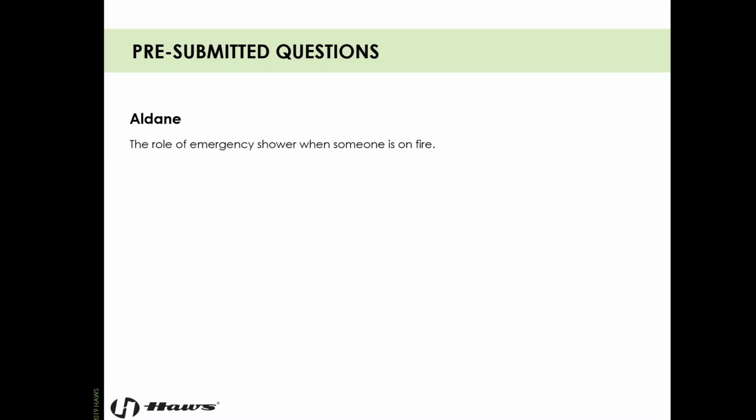Aldane asks about the role of emergency equipment when someone is on fire. I like this question so much, I gave it its own slide. There's nothing defined, but if you're on fire, an emergency shower is an excellent option.